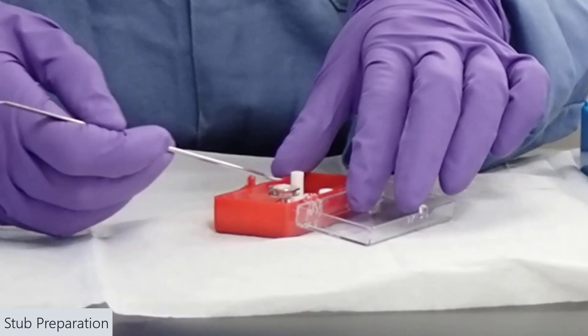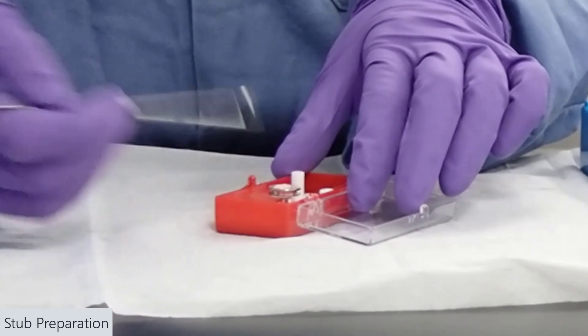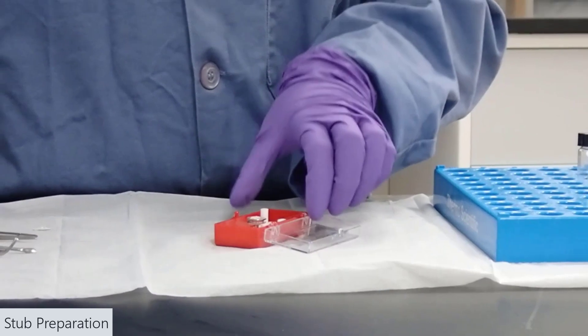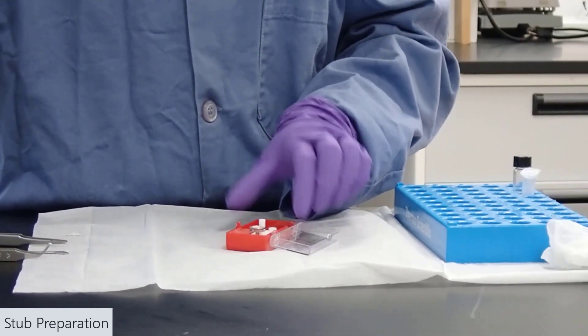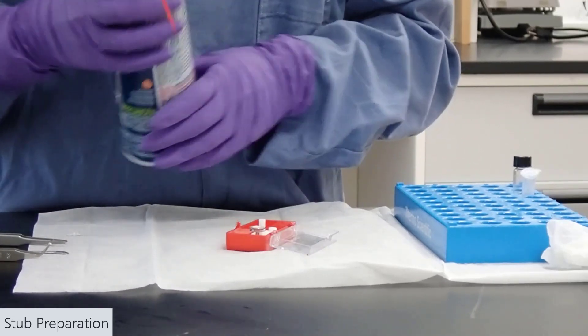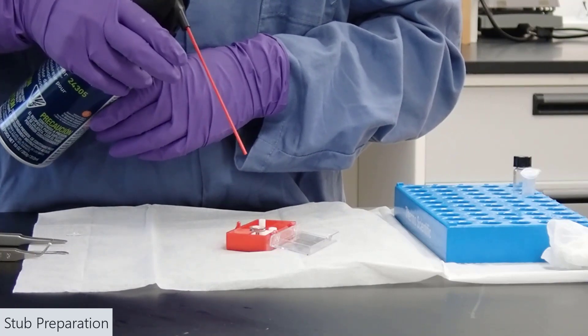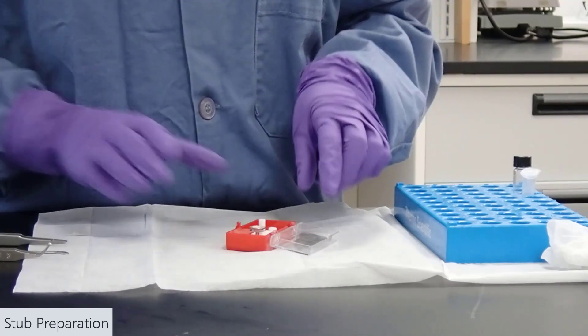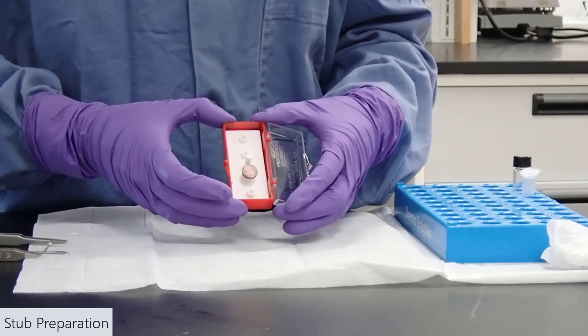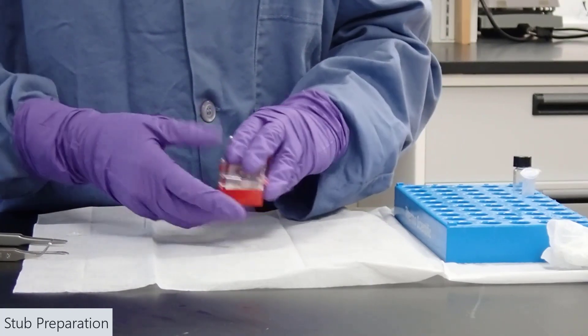So, put the powder on and then rub it, spread it out a bit on the stub. And the most important thing is, after we do this, we need to use compressed air to blow off any excess material. You don't want this excess material to go into your SEM and ruin the vacuum, so make sure you do that.